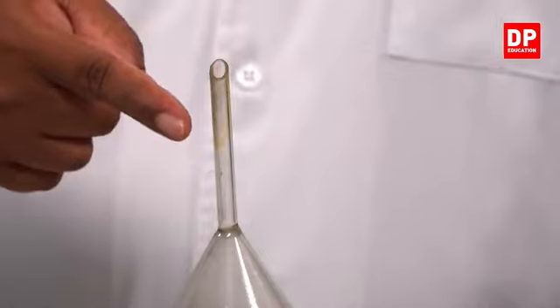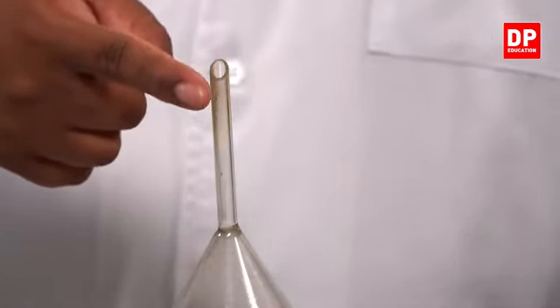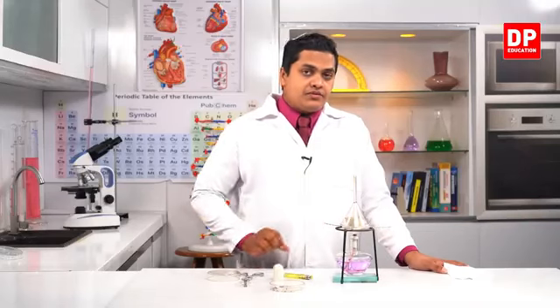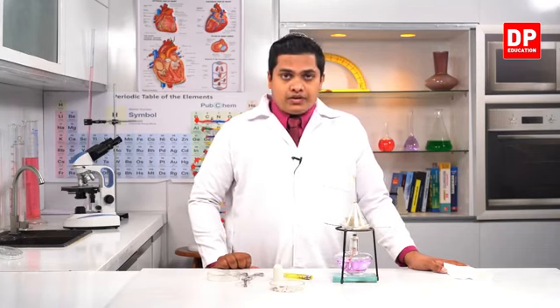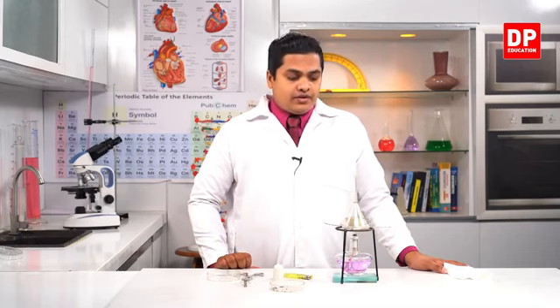And on the walls, you can observe the solid nature of the iodine as well. If I cool it down somewhat further, we can observe the solid nature of the iodine as well, right? So here, the iodine has been converted into a gas straight from solid. We can't observe an intermediate liquid state, right?